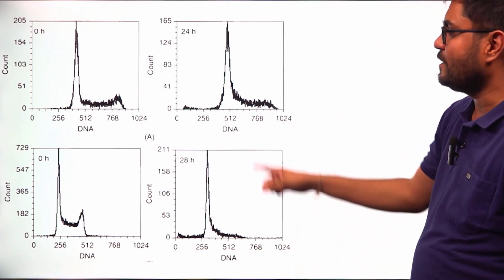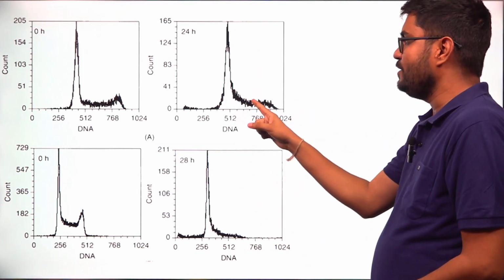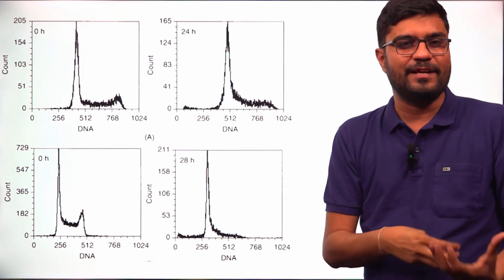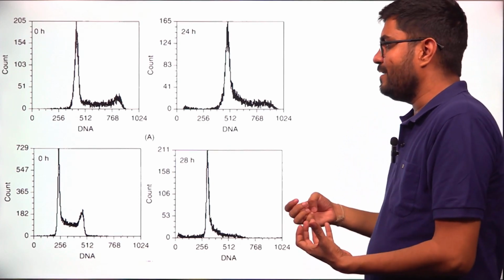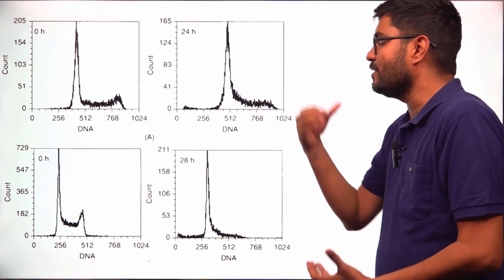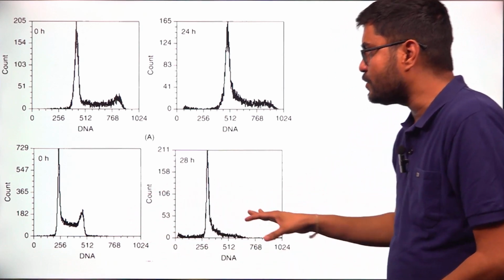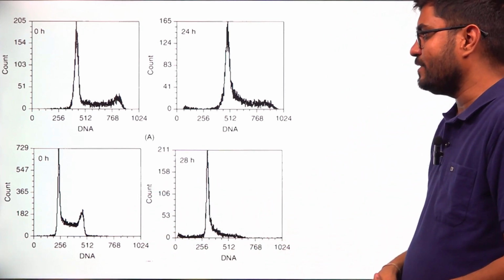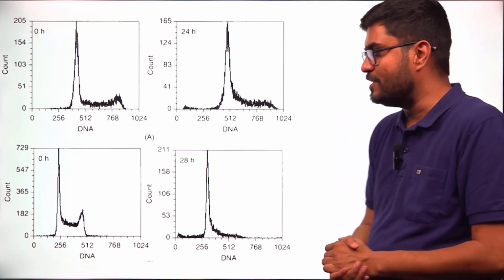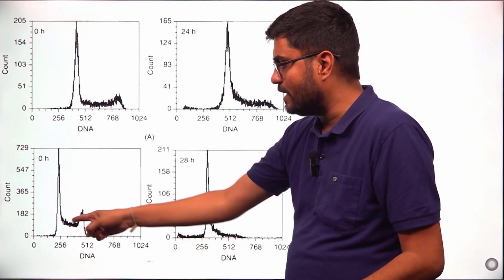And here the treated cells after 24 hours, you can see that the cells are mainly in G1, G2 is completely lost, and cells are doing abnormal or incomplete DNA replication in what? S phase. So the drug, the folate inhibitor, is blocking the cell cycle in what? S phase. Here in these two pictures, cells are treated with imatinib, which is a G1 blocker, which stops the cell cycle at G1 phase. So at 0 hours without treatment, we have all three peaks: G1, S, G2.